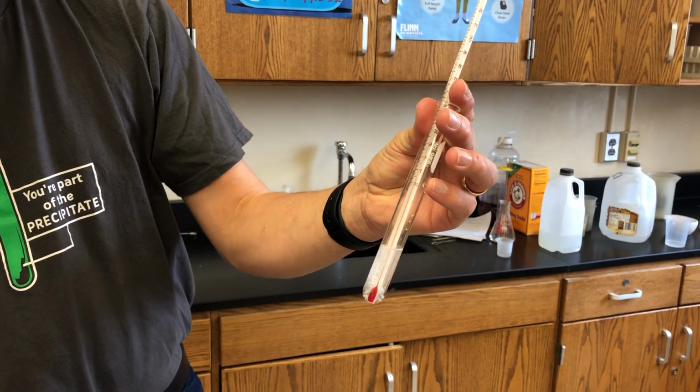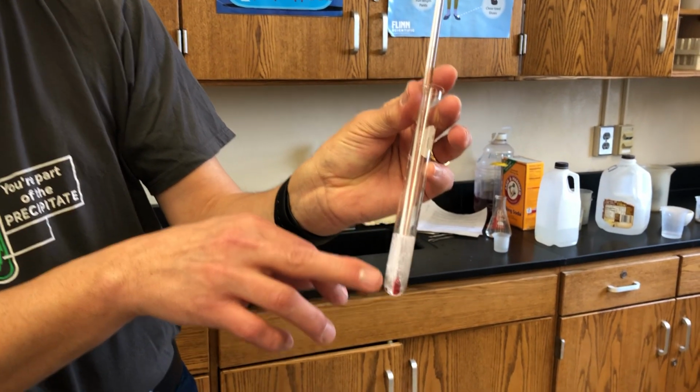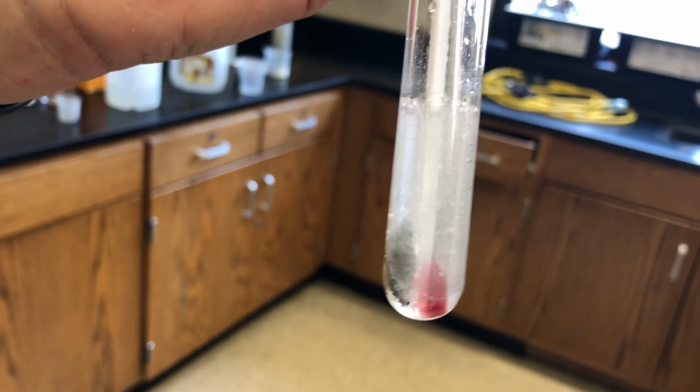Now as I put that in there, the zinc is bubbling. There is a reaction going on between the hydrochloric acid and the zinc, and there's lots of bubbles being produced.